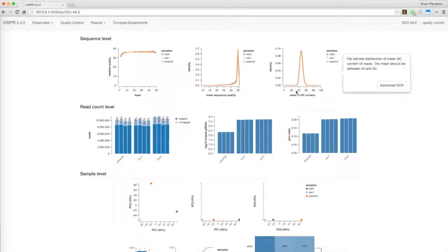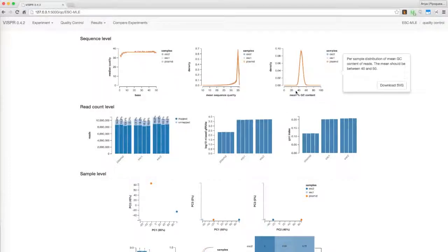Ideally, the data should have a median quality value over 25, and GC distribution should be consistent across samples. Based on these graphs, there should be few sequence quality issues with this demo experiment.